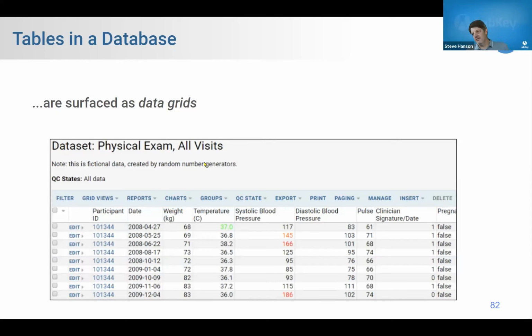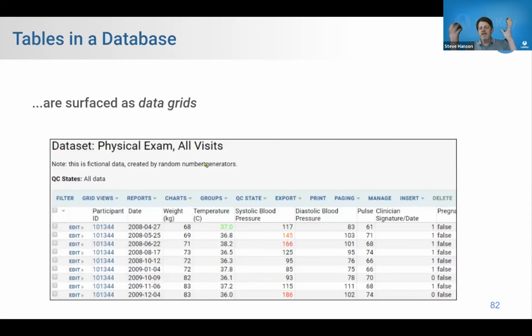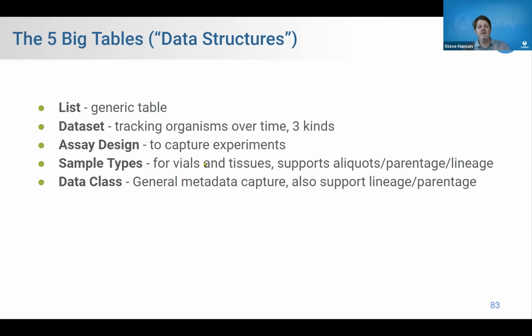Databases. This is the mainstay of the unit. I want to talk more deeply about databases and the data grids that surface them. Tables are all over LabKey. We played with a lot of them. They're not all created equal. There's 5 table types in LabKey.